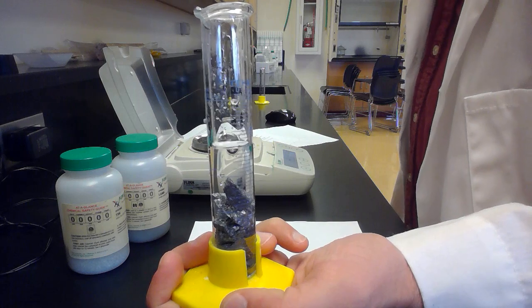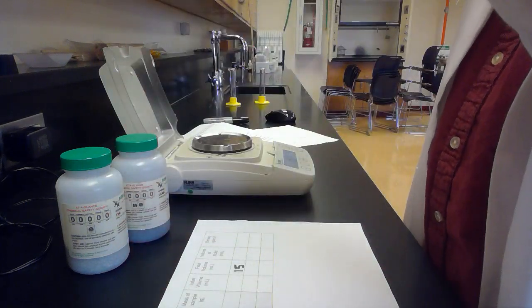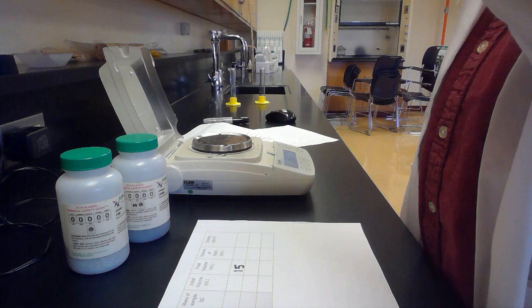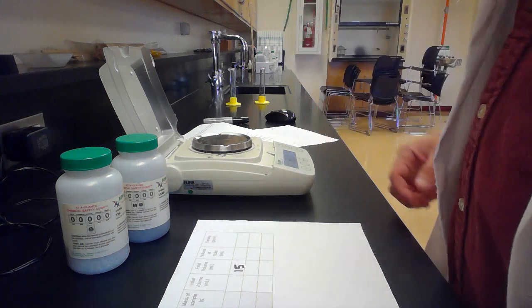Step number, what is this, step number 5? Measure the final volume. So now I'll read off the final volume. Let's see, that's 15, 16, 17, 18. Looks like just about 19 milliliters.